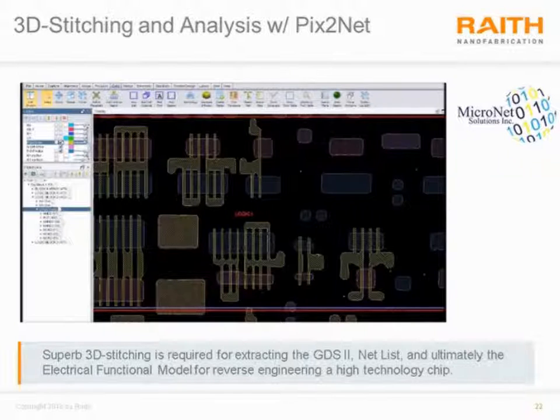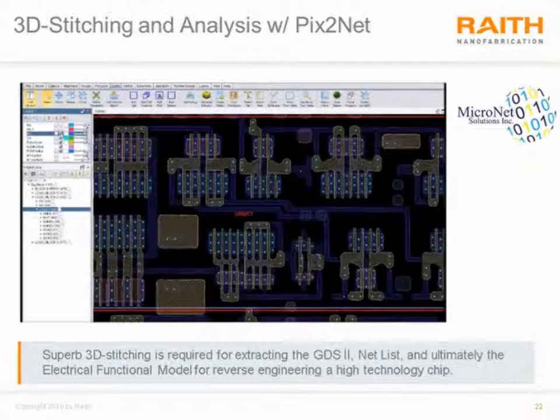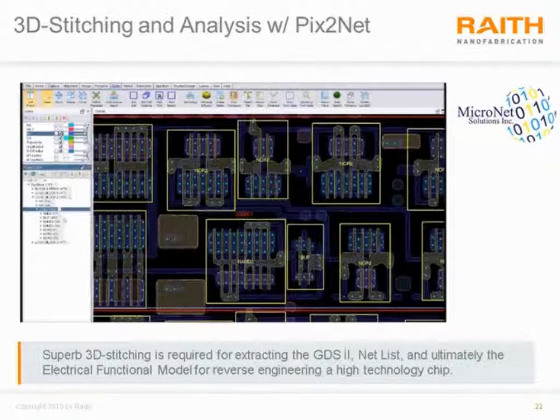So now we have a CAD design file essentially extracted from these SEM images, and color-coded features are appearing in CAD for all 3 layers. So this CAD design file can be further analyzed to identify unknown circuitry. And so here the software has identified the Logic 1 library. And we can see that this Logic 1 library actually consists of a few different NOR, NAND, and buffer circuits.